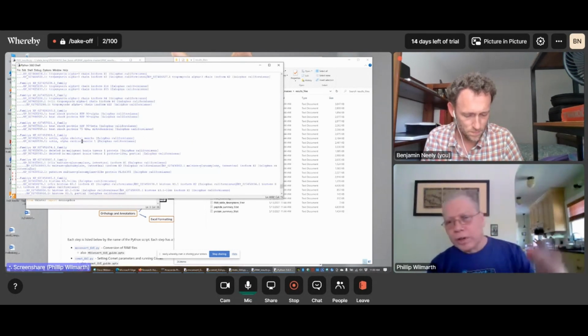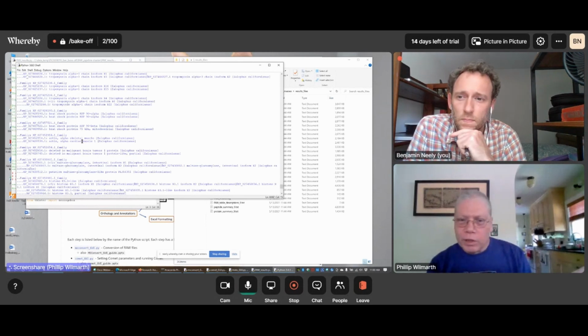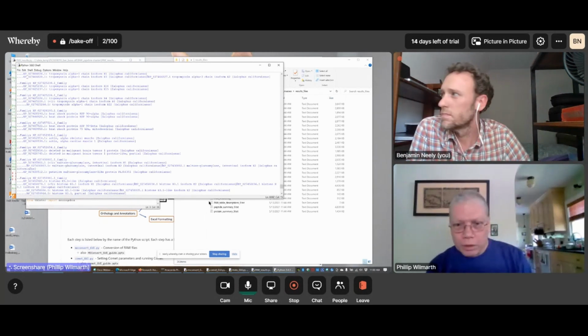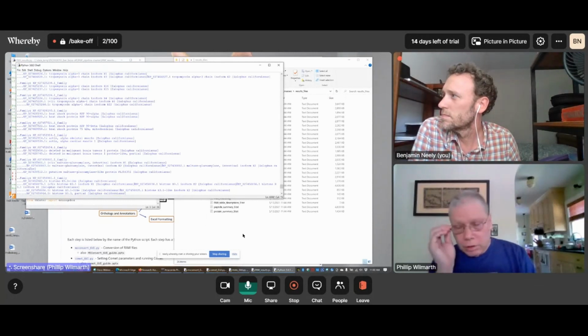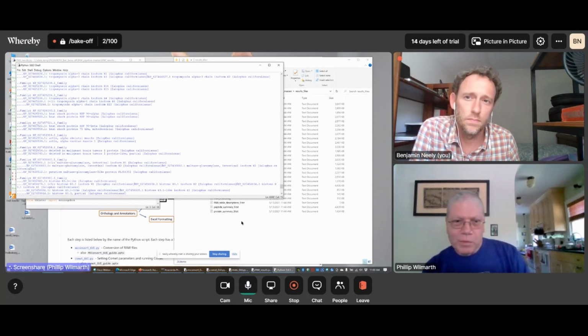But it gives a full report here. And you can also look at just the plain protein summary if you don't want the grouping. So it writes both out. I usually use the grouping one as the main report that I look at. Hopefully that makes some sense.